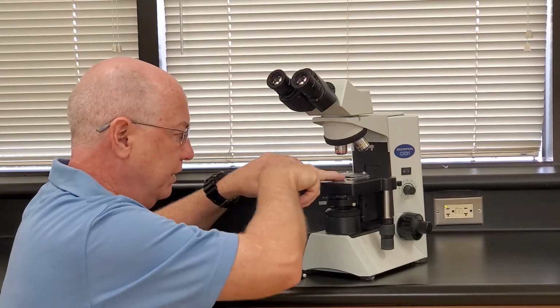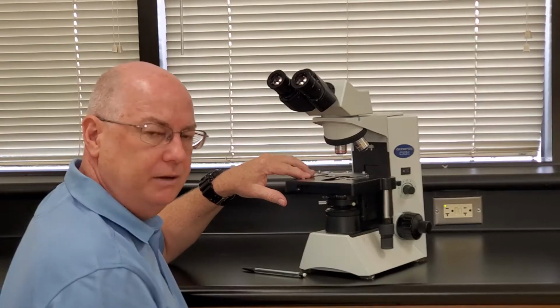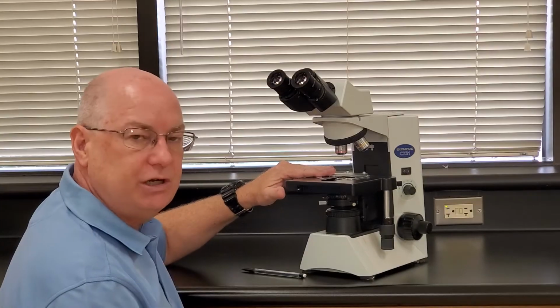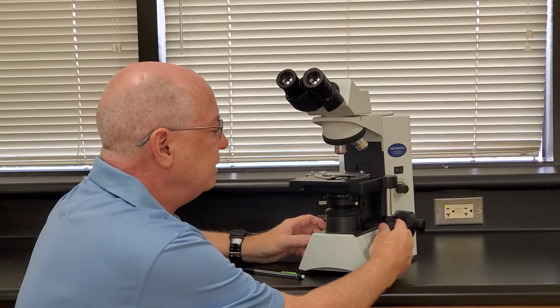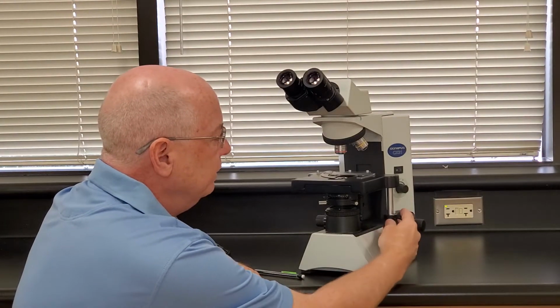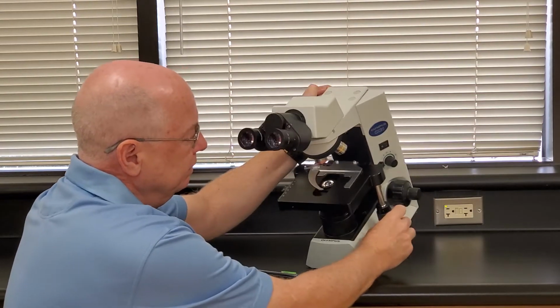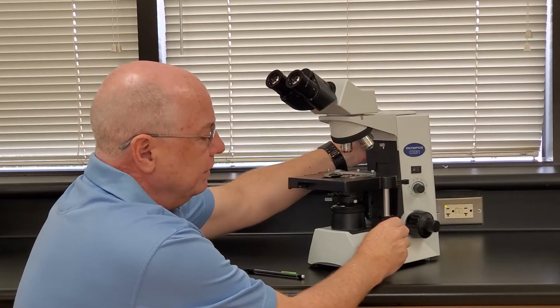You put your slide on, you put it back in this little corner securely with the label up, and then you set it on here. Now the reason this stage clip, and you need to know this metal part is called the stage clip, I want you to know it as the stage clip. That stage clip is going to hold your slide so that when I move these knobs, you can see the stage moves, and if I look down on here, I can see that the stage clip moves side to side. That's how we're going to find the object.